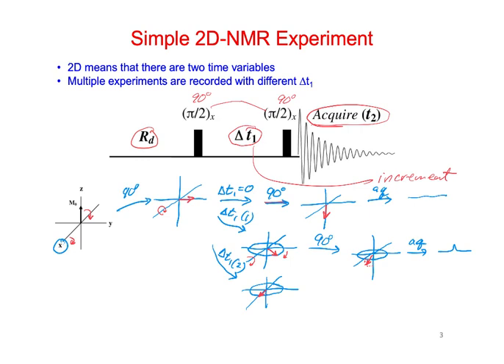Depends. Yeah, I think what happens is when you set it up, so it partly depends on, so one thing you can choose is how many increments in T1 do you want. And the increments here, okay, so here, the number of increments really defines our resolution in this T1 dimension.